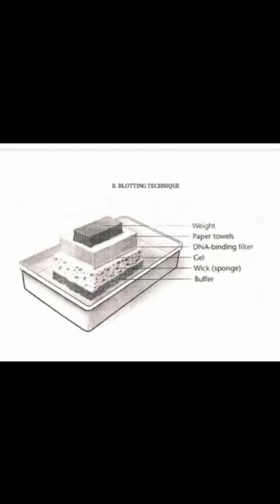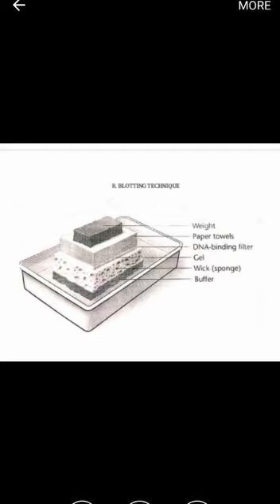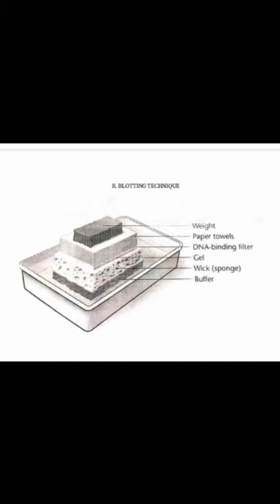Blotting is a technique for detecting DNA, RNA, or protein initially present in a complex mixture. In this technique, the molecules separated by gel electrophoresis are transferred to a nitrocellulose filter. Three types of blotting techniques are commonly used for visualizing particular macromolecules.